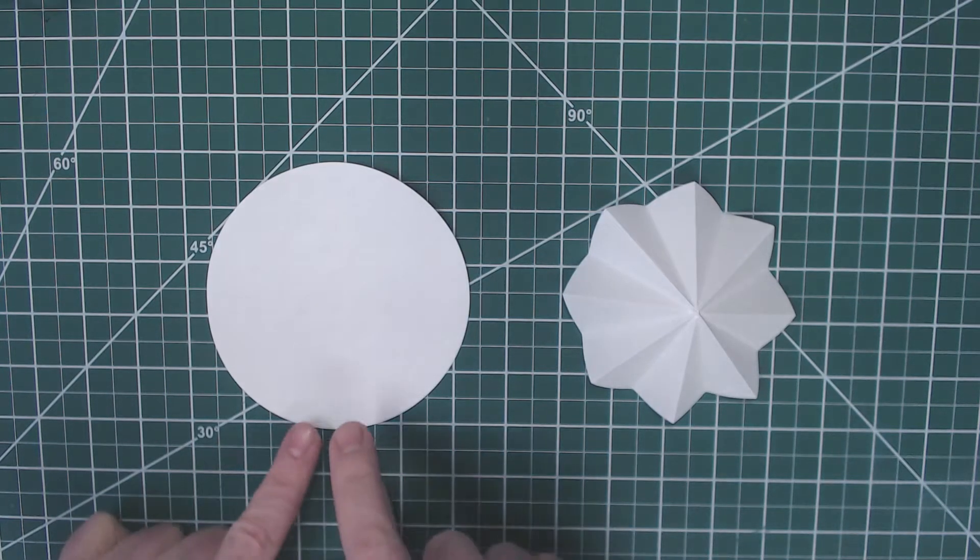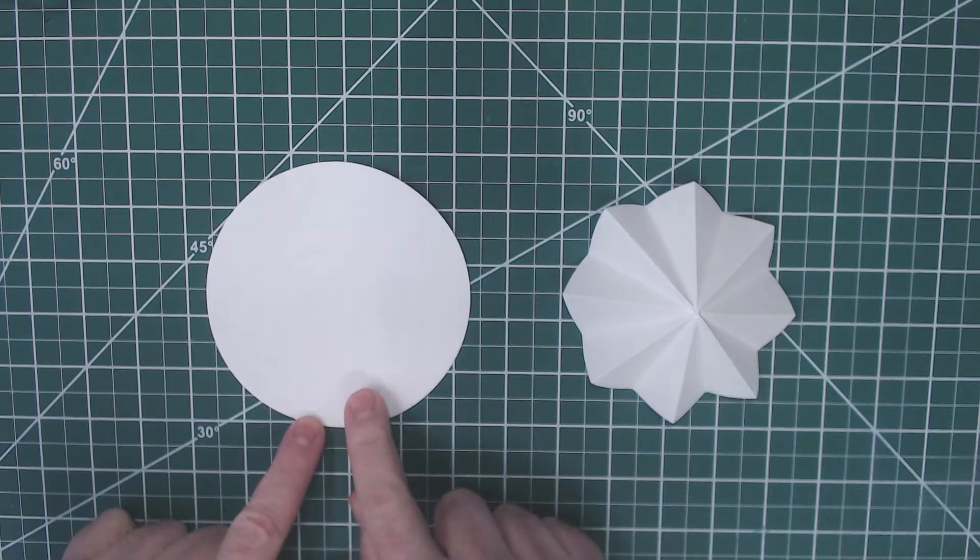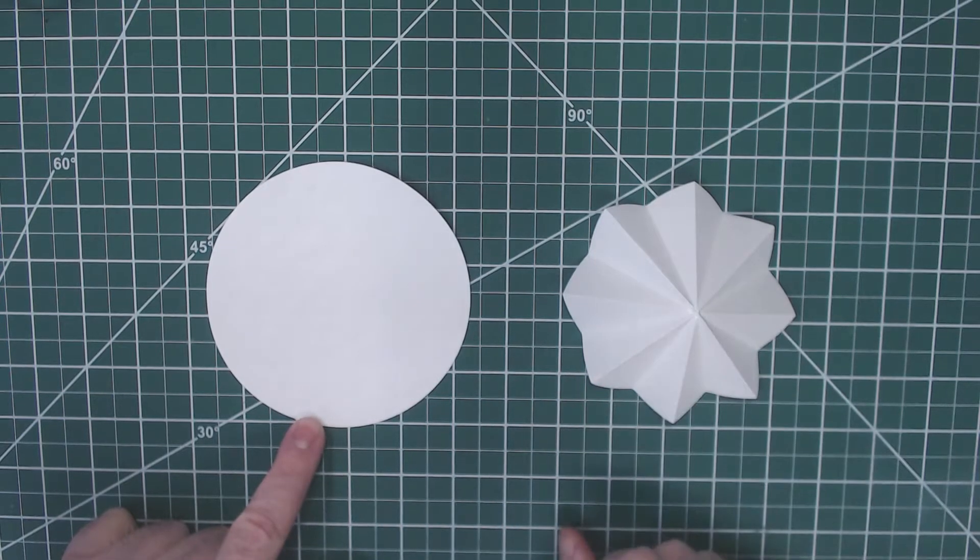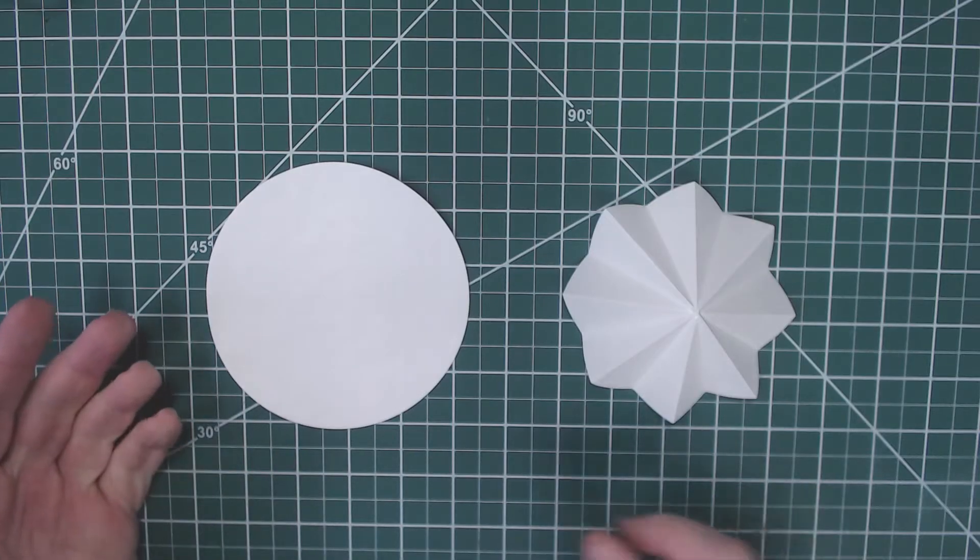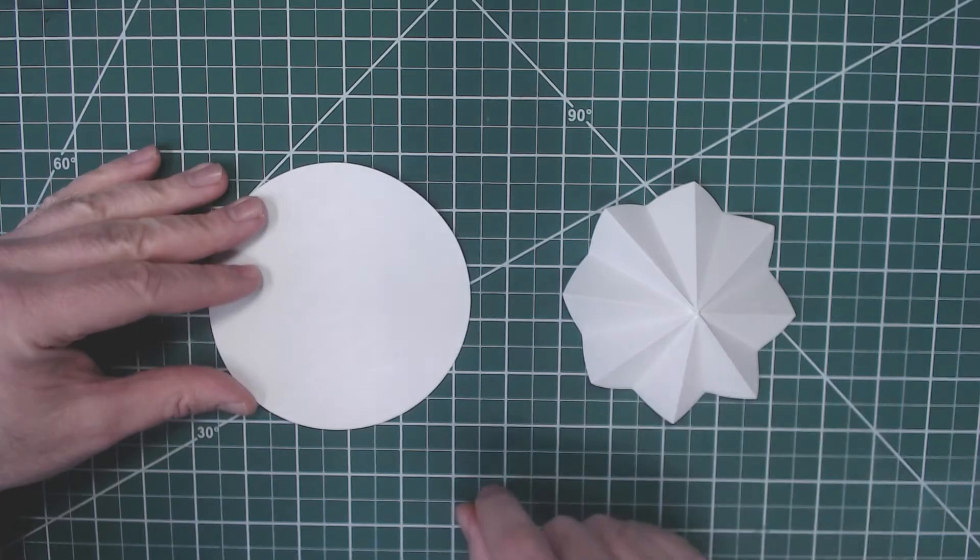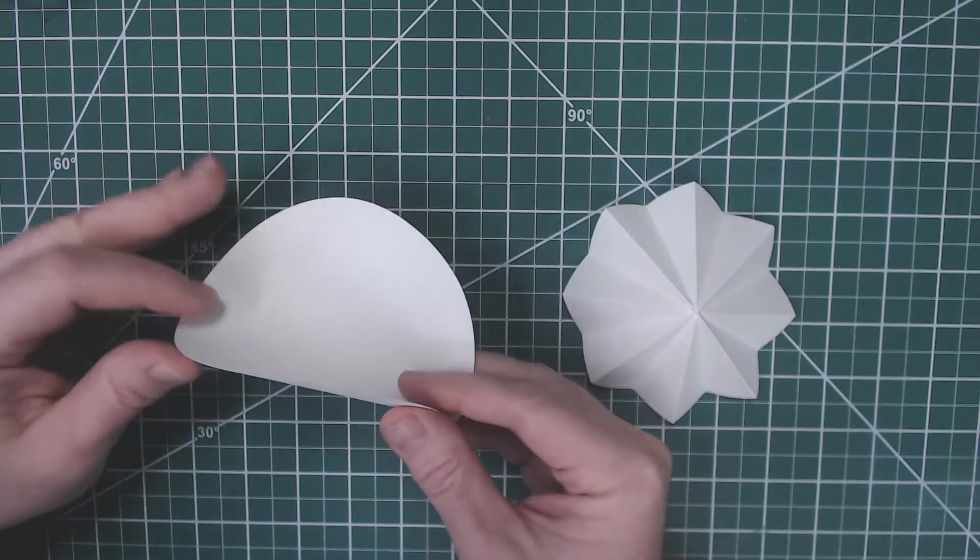Today I'm going to show you how to take a regular piece of flat filter paper and turn it into fluted filter paper. Now you can buy fluted filter paper, but why would you? If you have the flat filter paper, you can fold it like this in just a minute.